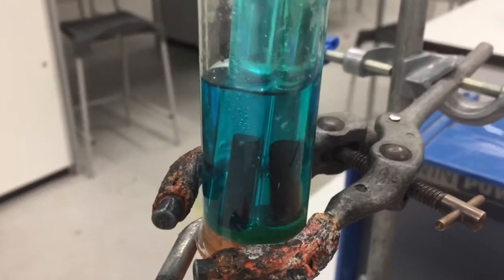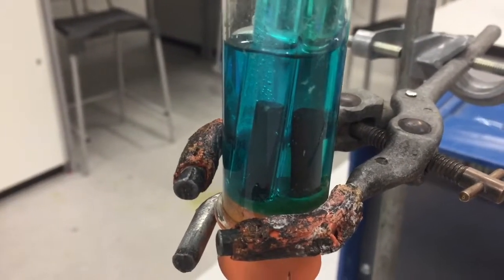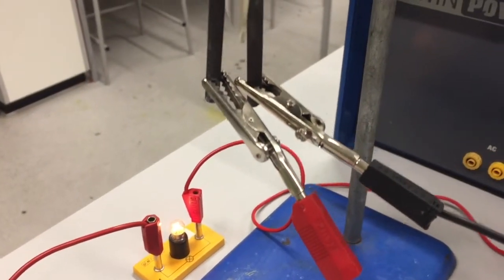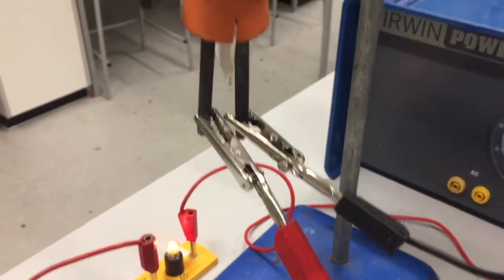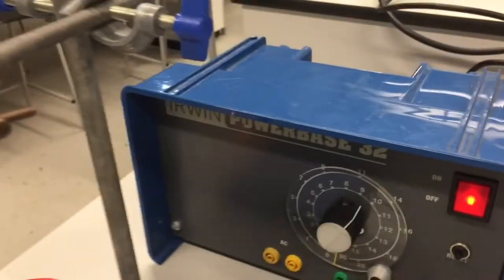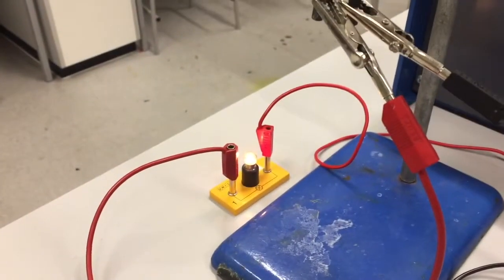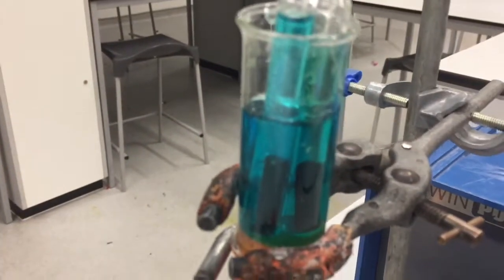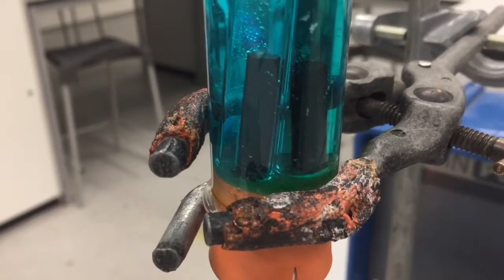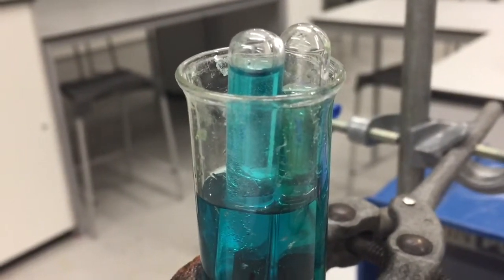It's not going too fast at the moment, and I think the reason really it's not going as fast as it should be is because we've got the bulb taking a little bit of the voltage here, because the voltage is being divided. So I'm going to turn that up a bit, okay, to about 10. Normally I'd run this on 6 without the bulb, but the bulb's quite good because it tells you that there's an electrical current flowing. So obviously we can see there are bubbles of gas, nice streaming bubbles of gas being produced there, and we're getting chlorine gas produced here.